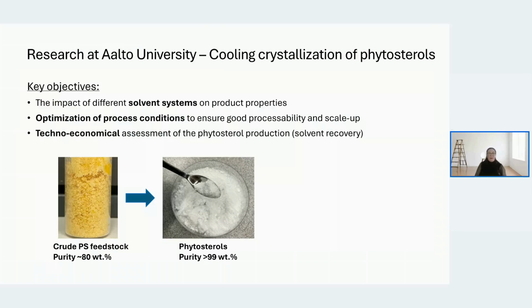Some words about my work at Aalto University. As I mentioned, the design focus is to design a purification process for this crude phytosterol-rich feedstock. You can see in the picture that it's a yellowish, slightly sticky material, and we have roughly 20% impurities involved.